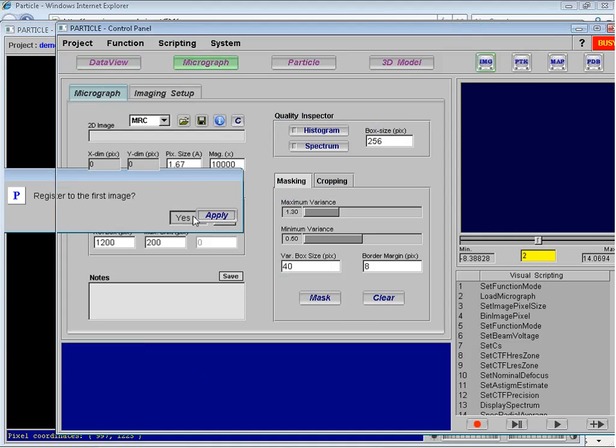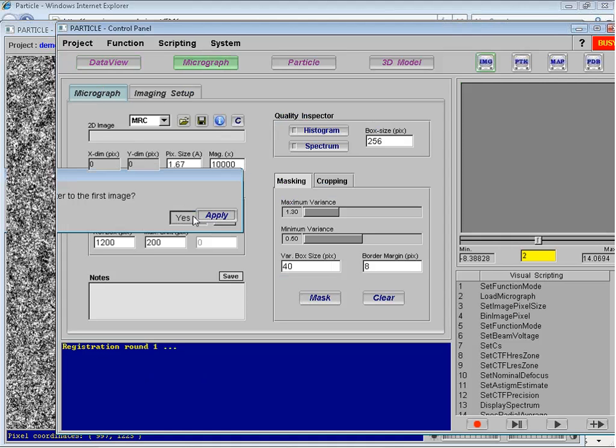Basically, it uses pixel intensity for image registration over a sizable area. In this case, it looks for similarity over a 1200 pixel tile, and to maximize the cross correlation between two images. So there's no need for fiducial marks.